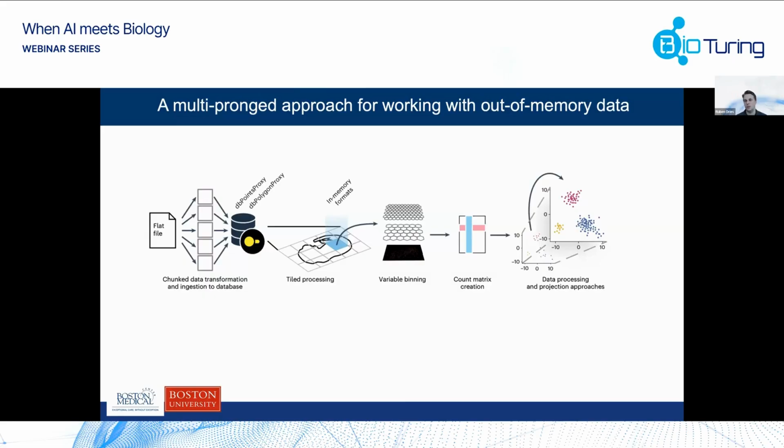Yeah, so there are two approaches, right? If you have access to a supercomputer with a lot of data, or you just have enough memory, or you can use a cloud where there's enough, then all of this is not necessarily needed. You can just use Giotto Suite as it is and work in memory. I do think to some extent, we also try to make spatial data analysis accessible to everyone.